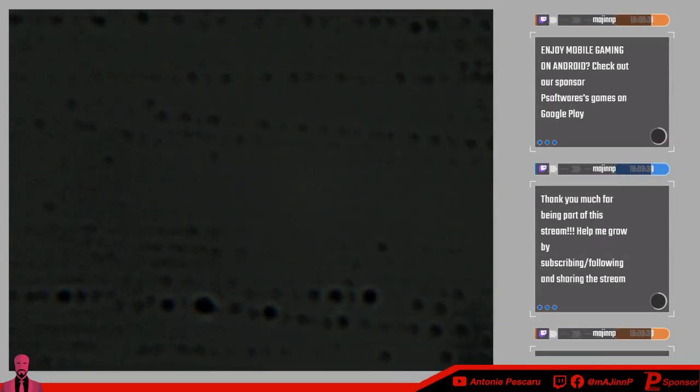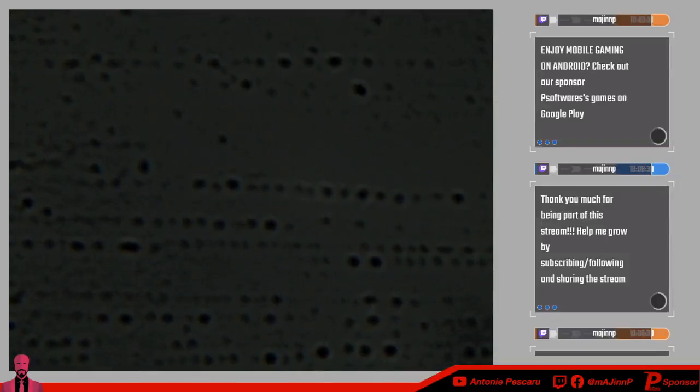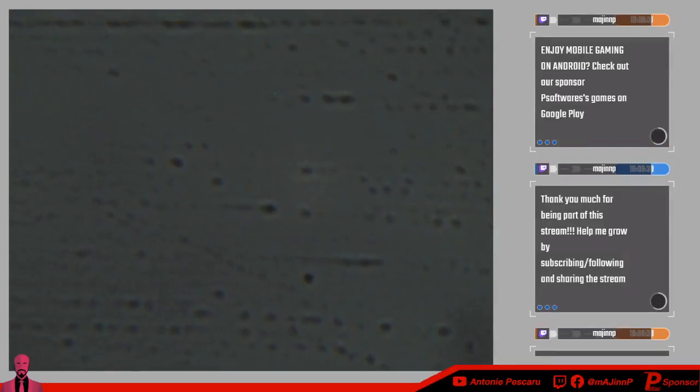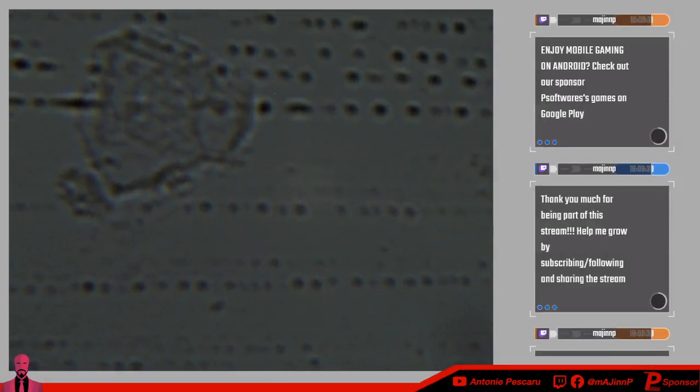No, I think it's the same problem. It's really hard to pinpoint a cell with this thing because it's super. I'm just gonna bump up the exposure so that people can see what I'm doing. The reason being is that this lens, not lens, but optic, I'm not sure what it's called, but anyways, this 40x lens. There we go.